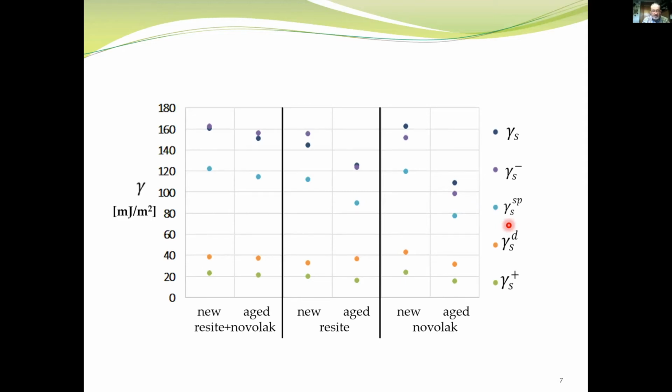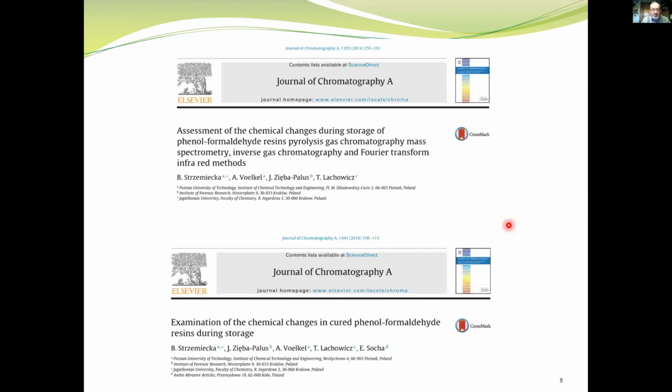These results were published in Journal of Chromatography, several years ago. And the manufacturer was satisfied with these results, and thanks to them, he changed slightly the technology and composition of the resin mixture.